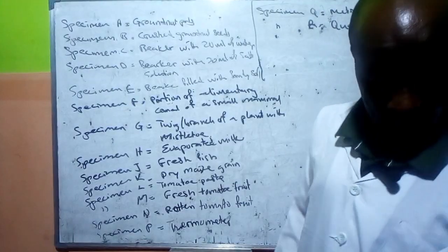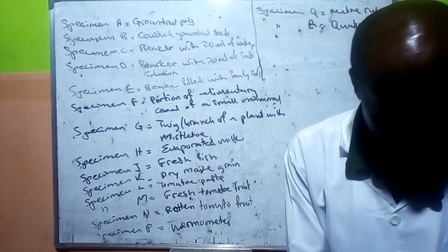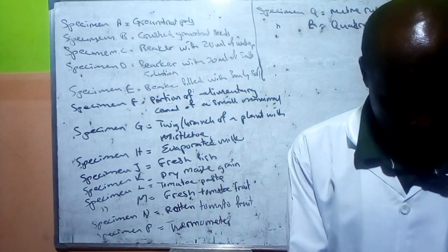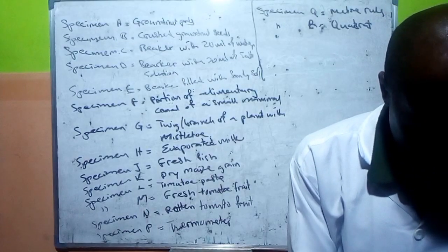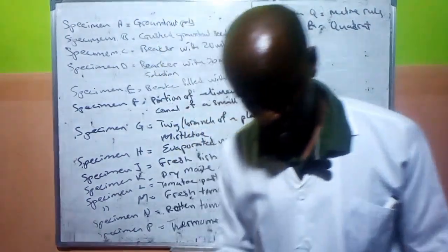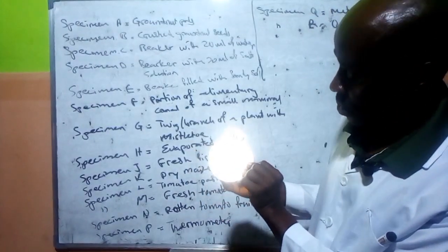Now what happens is that at the end of the experiment, with the filter paper, this is what you will observe. I don't know if it really appeared on the other side of it. I never knew that the thing was off along the line. Why is it off? I don't know. So look, this is what it looks like.